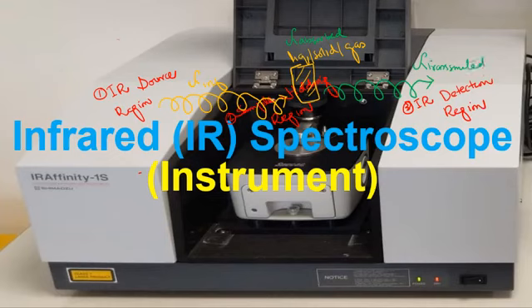On the basis of absorbed and transmitted infrared radiation, the infrared spectroscope generates a spectrum.